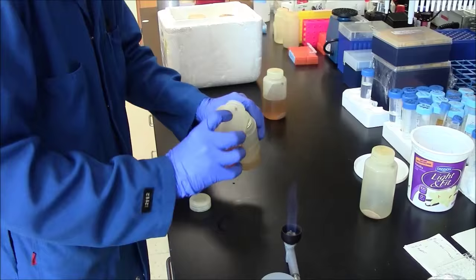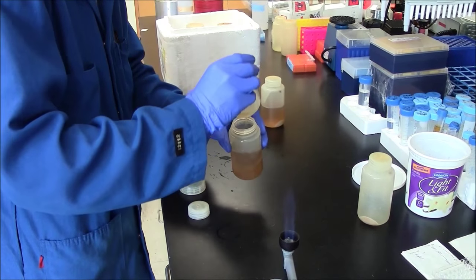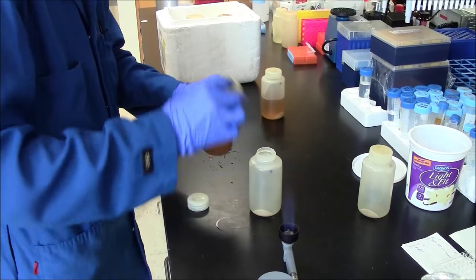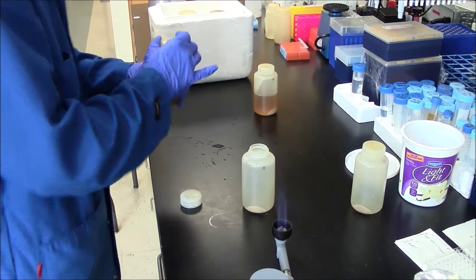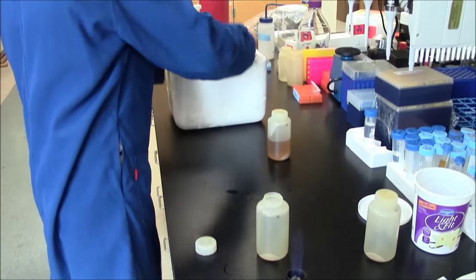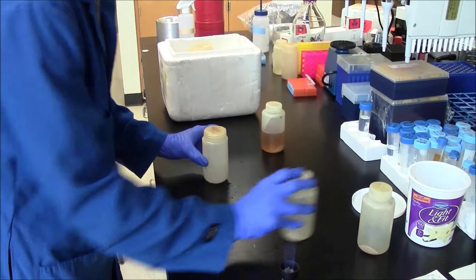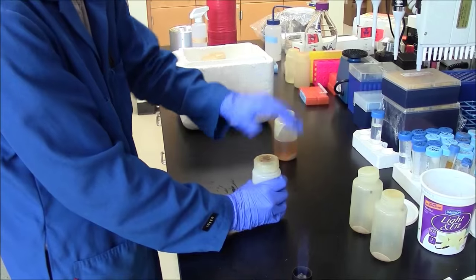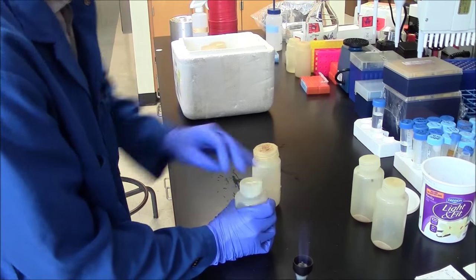So watch carefully. Transfer the supernatant, not the cells, into the pre-chilled bottles. The flame is optional. We wouldn't do that in ACR. Just make sure you don't transfer the cells. If you start transferring cells, we have to start all over.